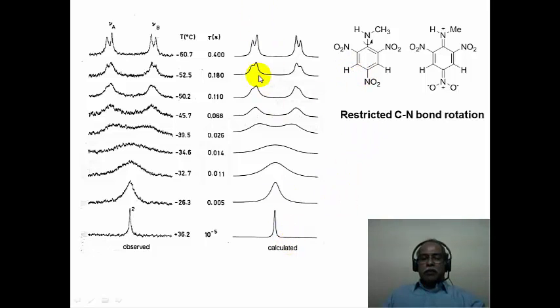This is a simulated spectrum based on computer simulation using this kind of a lifetime of this molecule for the various rotational rate constants. The inverse of this will be the rotational rate constant of the process that we are talking about.